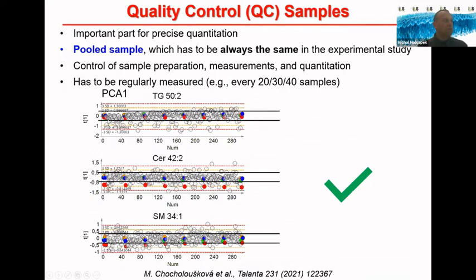If you monitor individual concentrations in a one-dimensional PCA graph, then you see individual colored points are at the same position, which means that your methodology really works well.